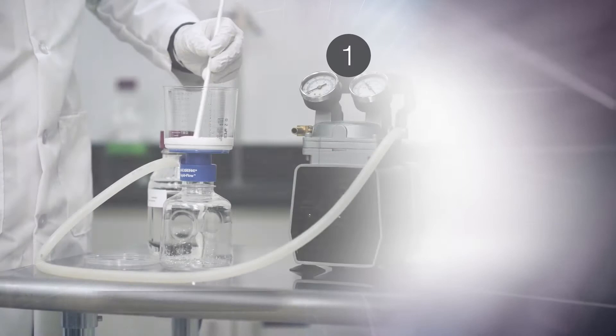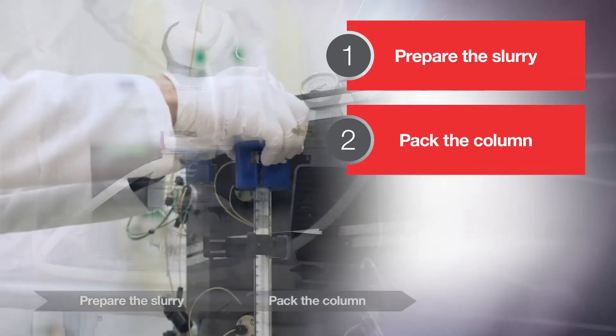The general steps for the column packing process are: prepare the slurry, pack the column, and qualify the column.